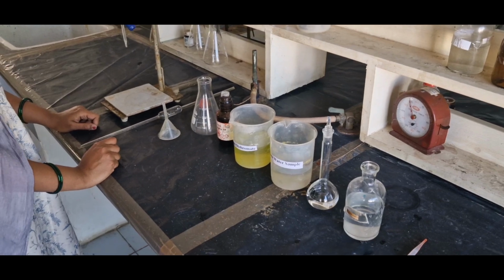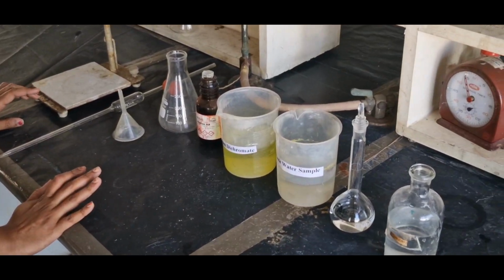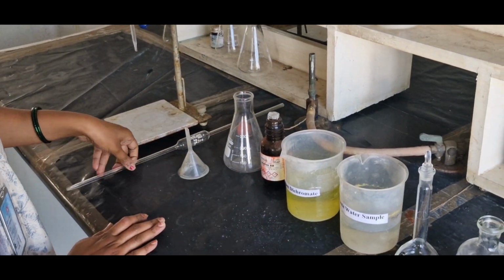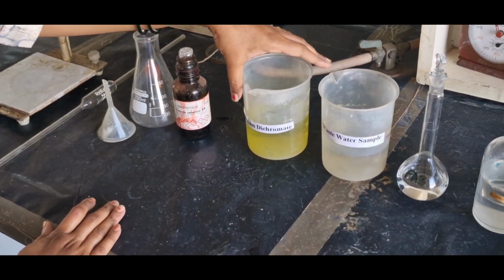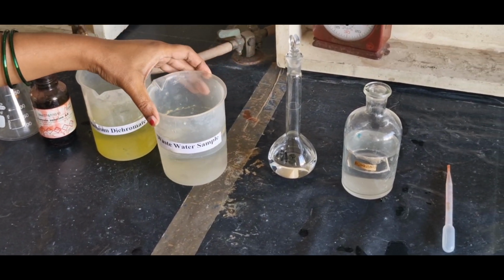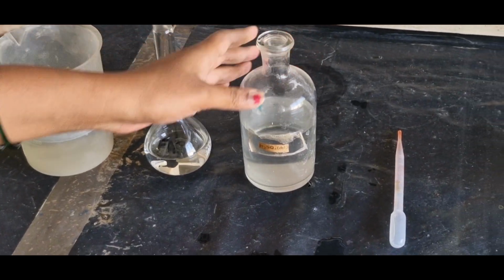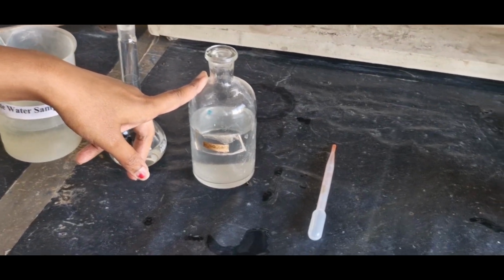Welcome students. Now we will see the practical part of the COD experiment. These are the apparatus required for the experiment. First is the burette. Next, a 25 ml pipette I am taking. Conical flask. This is ferroin indicator. Next is potassium dichromate solution. This is the wastewater sample containing dissolved organic matter. This is FAS solution for titration, and dilute H2SO4 solution which has dissolved silver sulfate and mercuric sulfate in it.